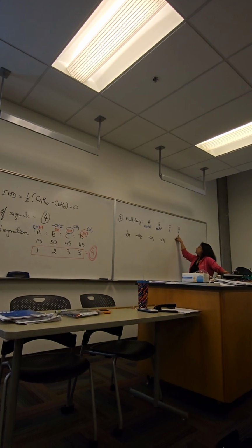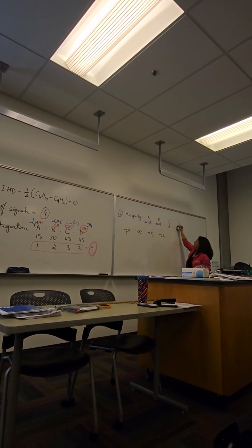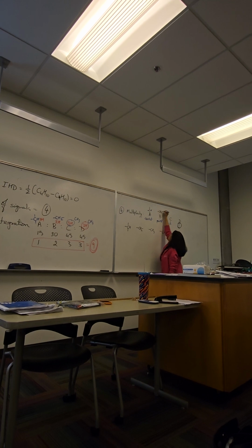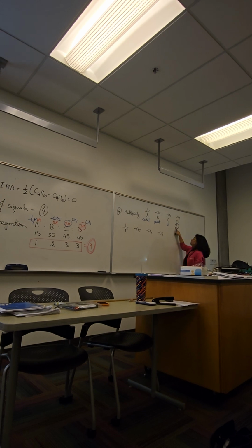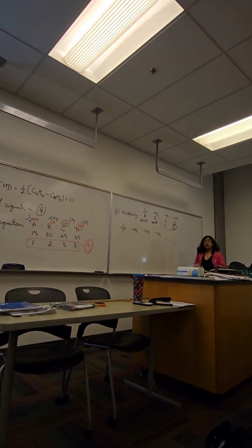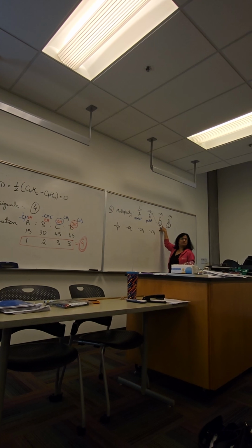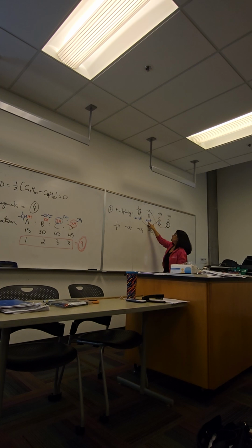If this is a triplet, what should this be connected to? CH2? Do you guys agree? Okay, fine. This is a CH, if that helps to label them right next to each other so we can see. If this is a triplet, does it make sense that it's connected to that? Yep. Okay. This is a doublet. So what should this be connected to be a doublet? The CH. Now that's a pentet.